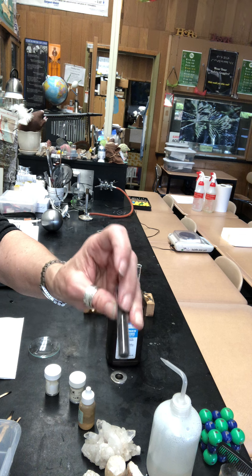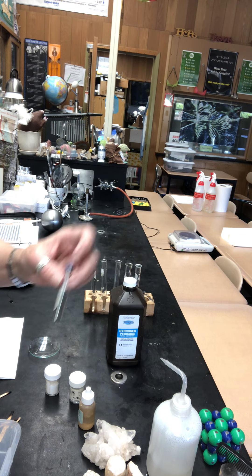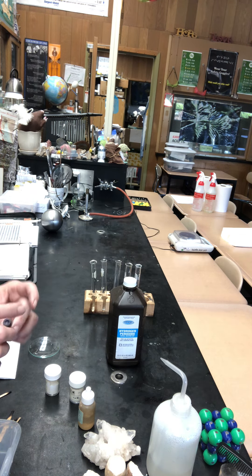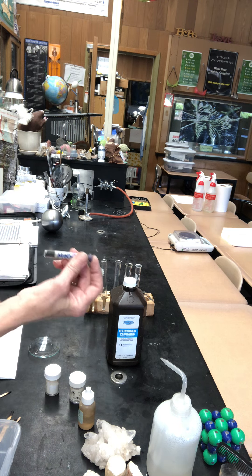And then I have this black powder that is in these little vials just for dispensing. It's MnO2. This is a catalyst.